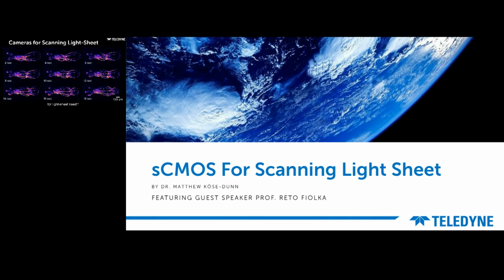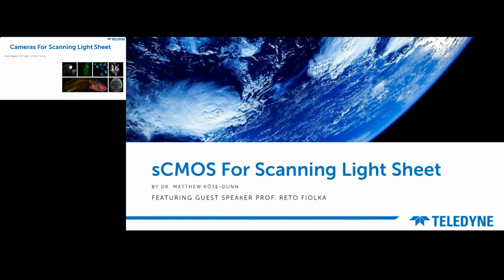So what does a camera for light sheet need? A camera for something like scanning light sheet should avoid compromise and feature best-in-class specifications from each of these major areas. First is sensitivity. If your camera isn't sensitive enough, you simply won't be able to see your sample at lower light levels, and you won't be able to answer any of the scientific questions you're asking. And sensitivity here is mainly controlled by minimizing the sources of noise and maximizing signal collection or quantum efficiency.